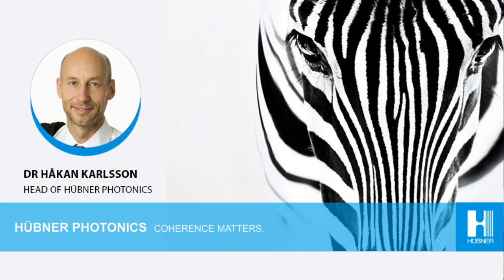So this is a related question to do with data sheets. Which of the main laser requirements are most challenging to achieve, and what specifications are critical when comparing data sheets from different laser manufacturers?